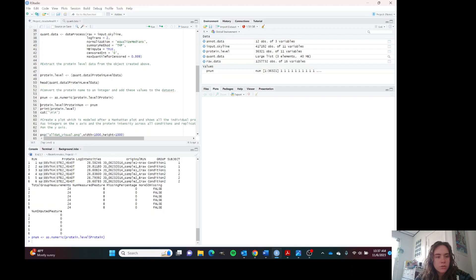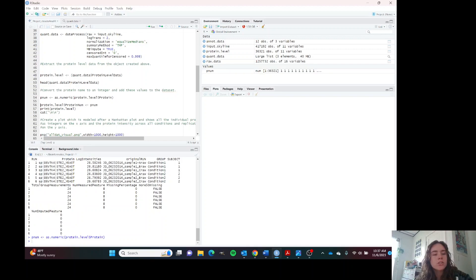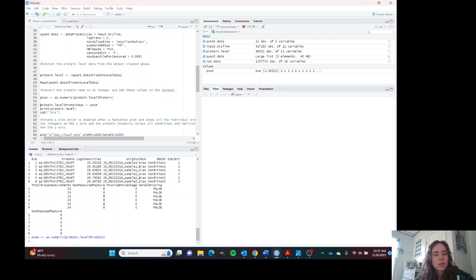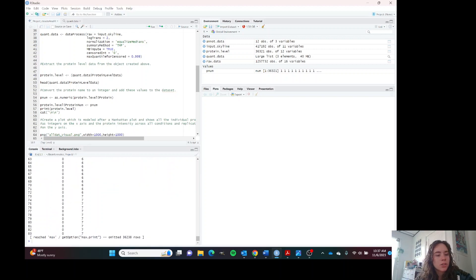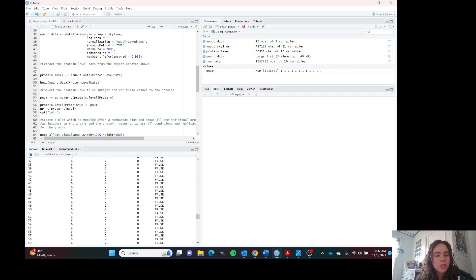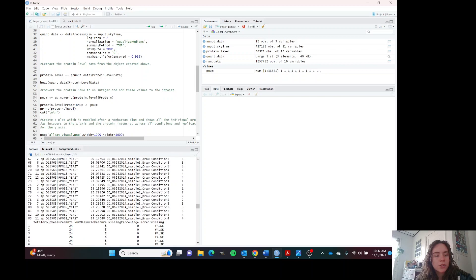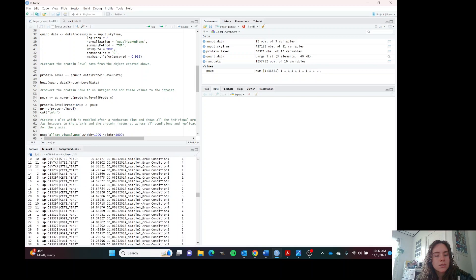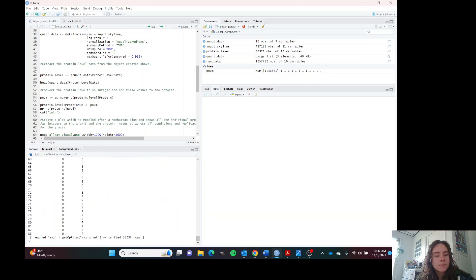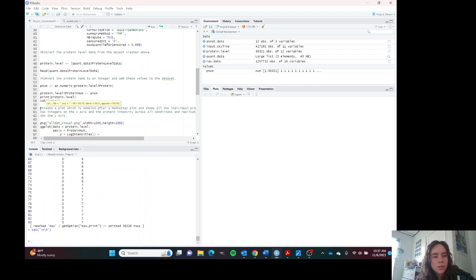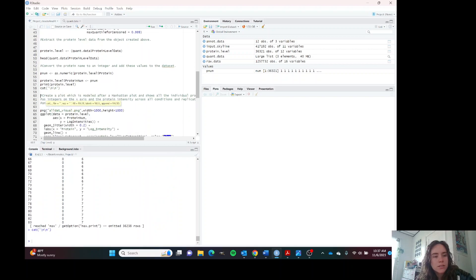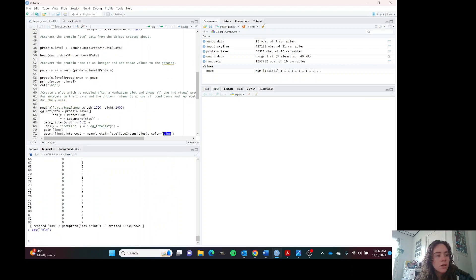We're going to do that now and now we're going to put these values into our data set as a new column and we're going to see what that looks like. That looks good. Every unique protein has its own number and we're going to make sure that that goes all the way through the data set.